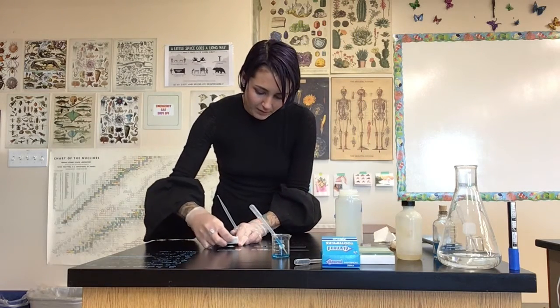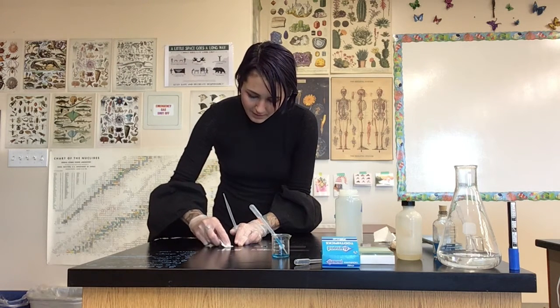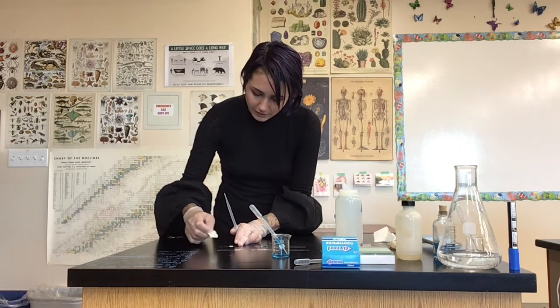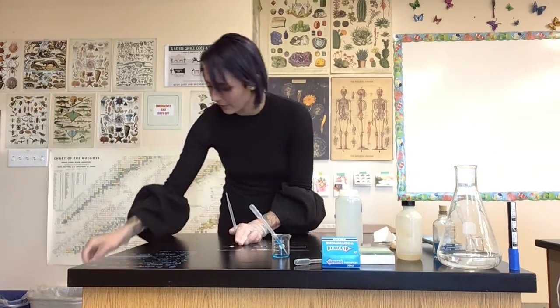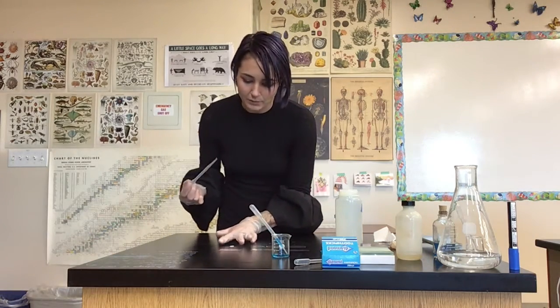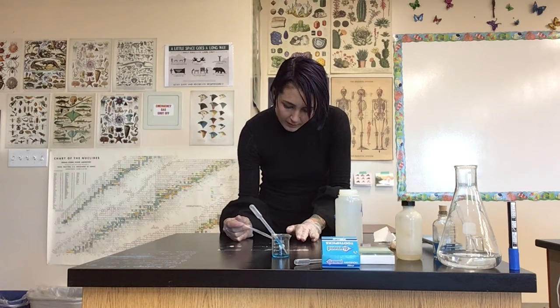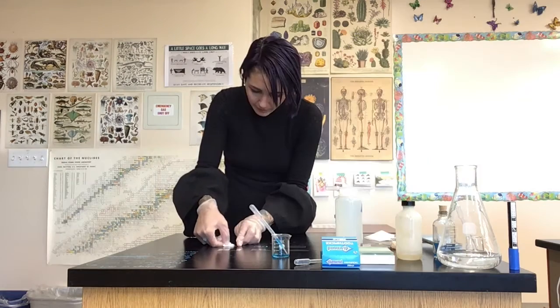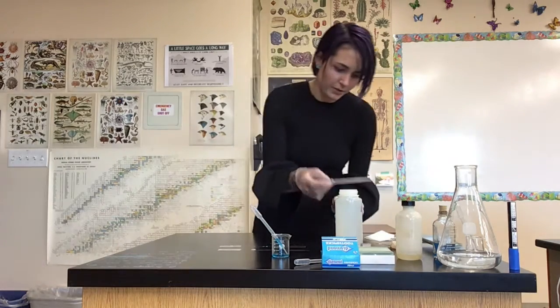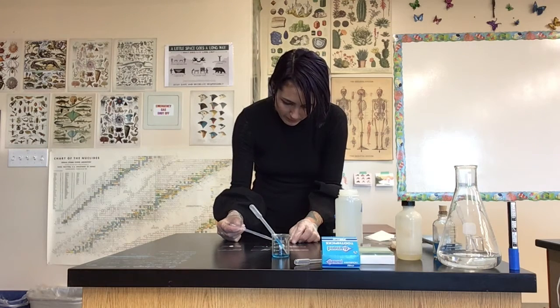Before I was able to do that, my timer went off. So let me go ahead and soak up the extra hydrogen chloride from my other slide here. Perfect. Now I can just do them both at the same time. I'm going to take my deionized water and rinse off any excess hydrogen chloride. Okay, so we're going to do a few washes of this. That was my first wash, and then let me do my second one.